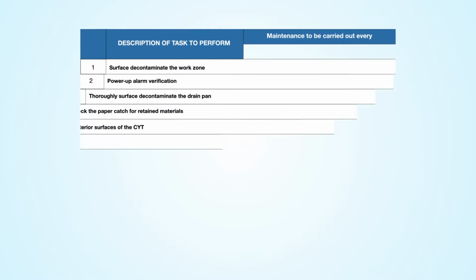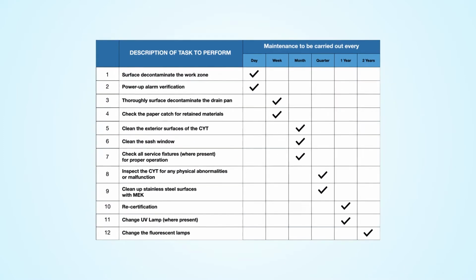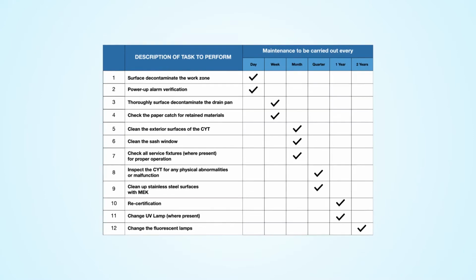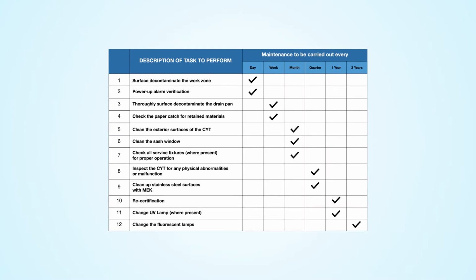Cabinet maintenance. Proper and timely maintenance is crucial for trouble-free functioning of any device, and your Esco cabinet is not an exception to this rule. We strongly recommend that you follow the maintenance schedule suggested hereunder to obtain optimal performance from your Esco cabinet.